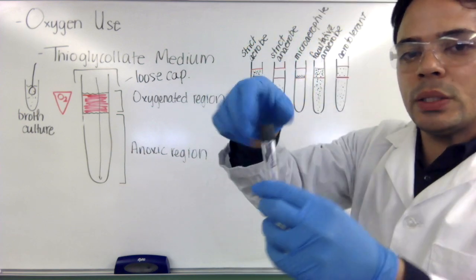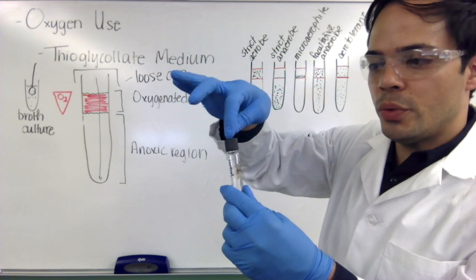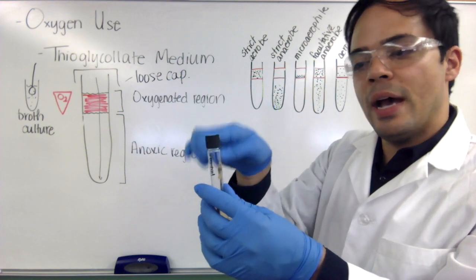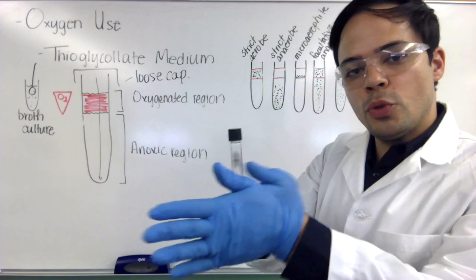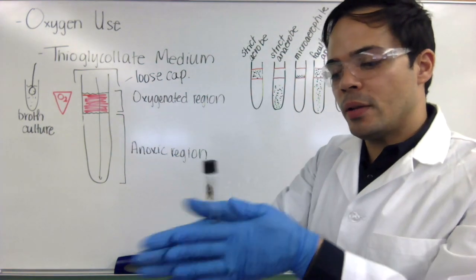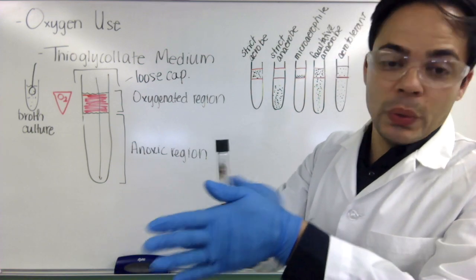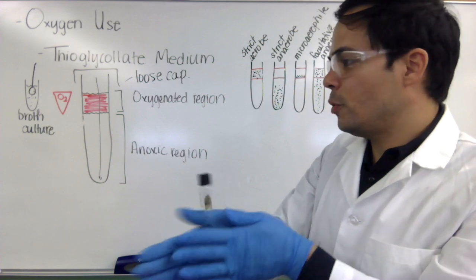So once it is inoculated, close it all the way, open it a half turn to ensure that the cap is loose, air can get in and out. And then you want to rub it between your hands a few times. That will prevent our oxygen gradient from being perturbed and also help to mix around the bacteria a little bit.